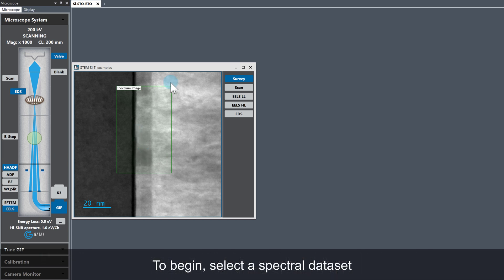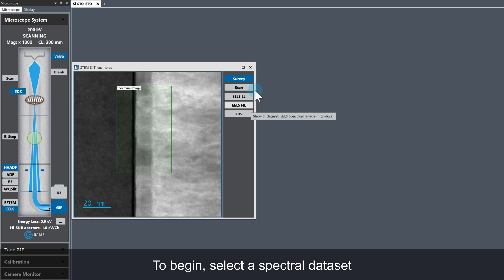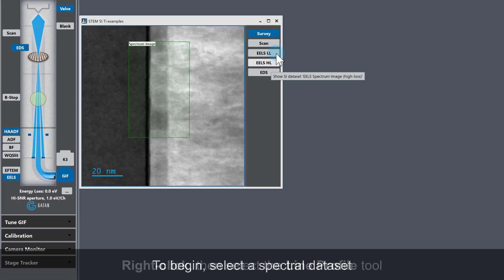First, we need to select one of the spectral datasets. This dataset is dual EELS, so we have EELS low loss, EELS high loss, and EDS. I'm going to select the EELS high loss.